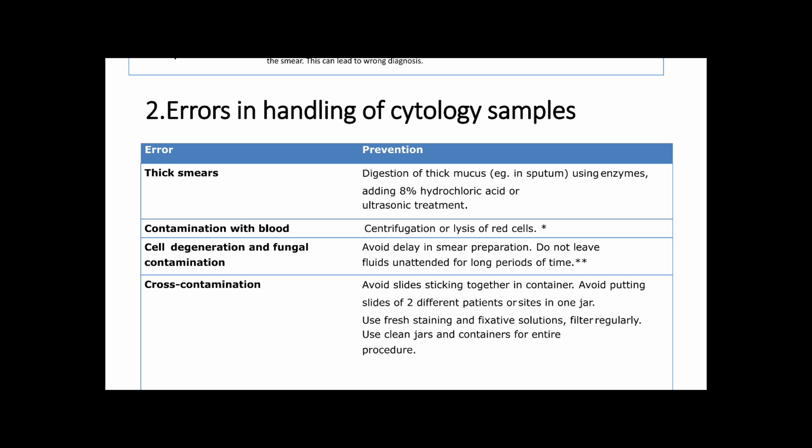The third problem is cell degeneration and fungal contamination. How to prevent this? Avoid delay in smear preparation. Do not leave the fluid unattended for a long period of time. So, cross contamination.